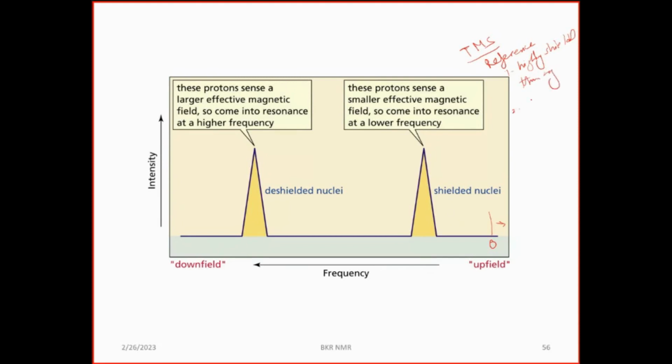Second point, what is the second point? It is inert in nature. And since you have so many hydrogens, 12 hydrogens with the same chemical shift value, I can use only a small amount. If I use a very little of the TMS, I can see the signal at 0. So we will never miss the signal of TMS, even if we take a small speck of the compound.